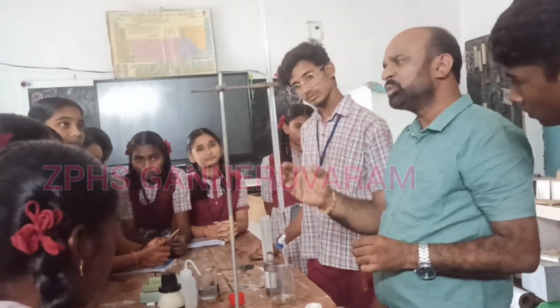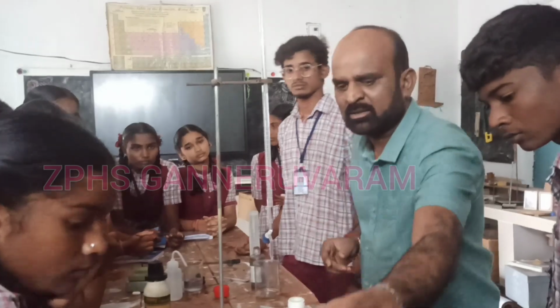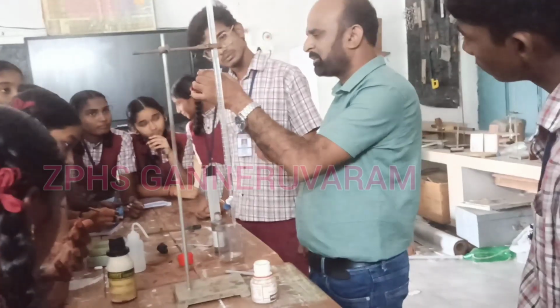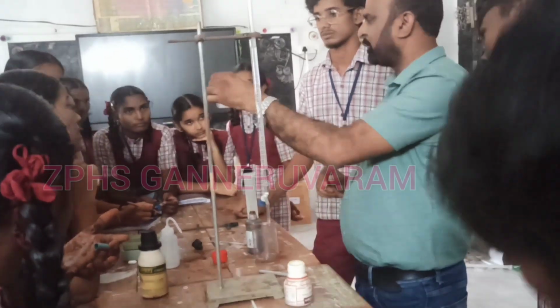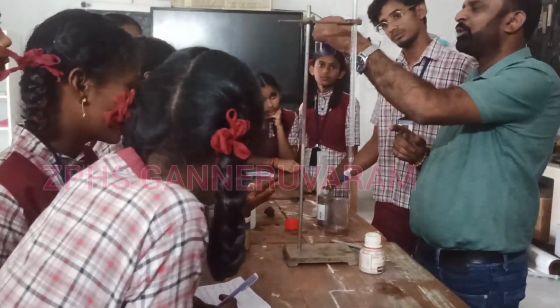So why do we use this burette? If you take the beaker with the sodium hydroxide and add this red litmus, the red litmus changes to blue color.